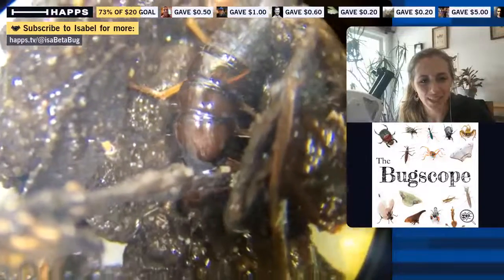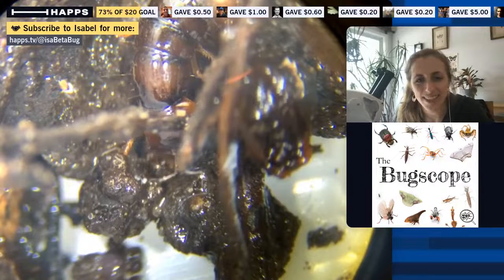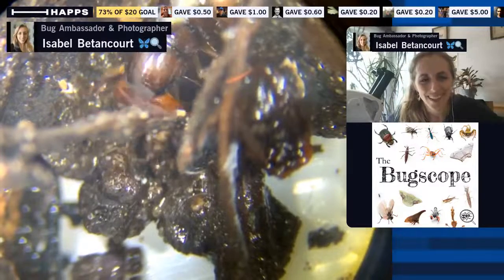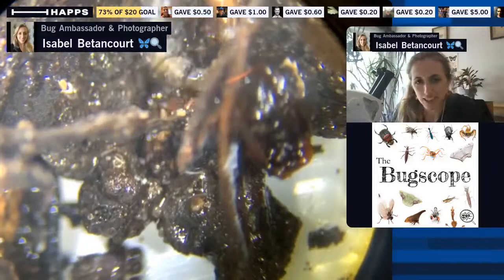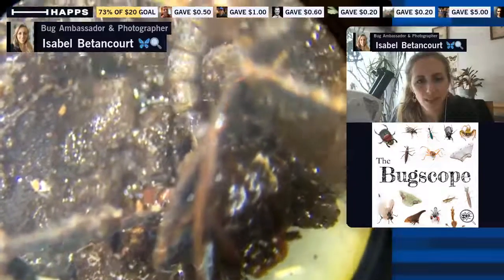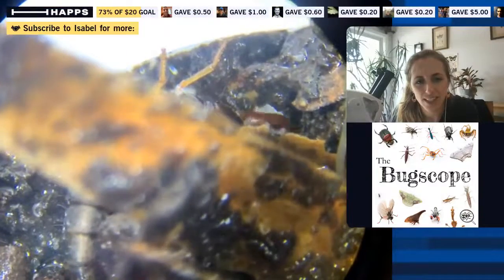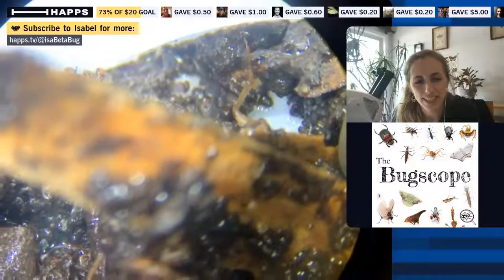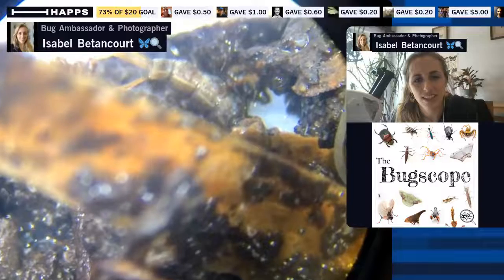Christine's asking, 'Do you know what those little hairs are for?' Great question — that crossed my mind too. It does have lots of hairs; in entomology we call them setae on its body. I'm guessing they're for mechanoreception — helping it perceive the world around it. So if the soil moves, it can sense that more easily. That's my guess. We call them setae — S-E-T-A-E is the plural, or seta for singular.